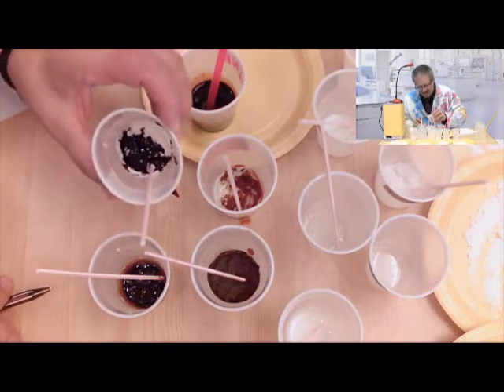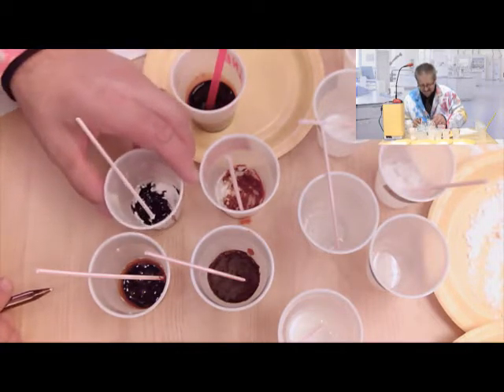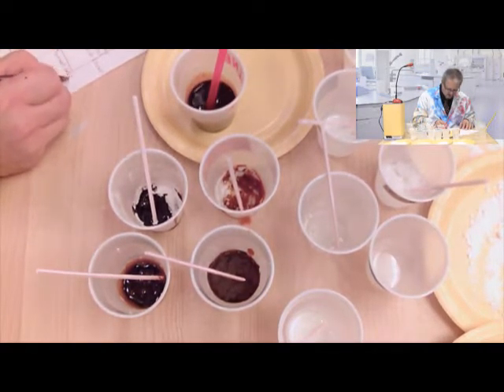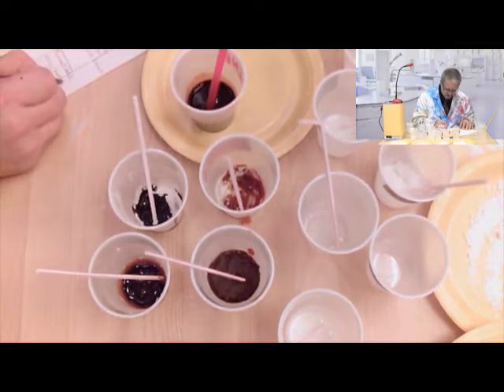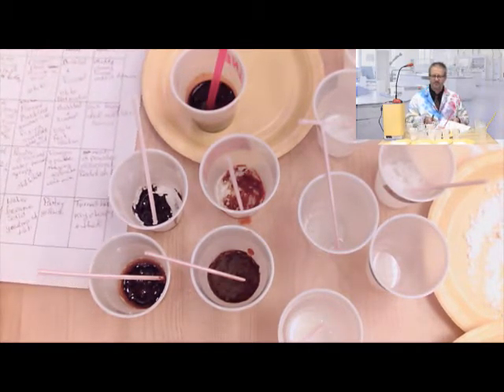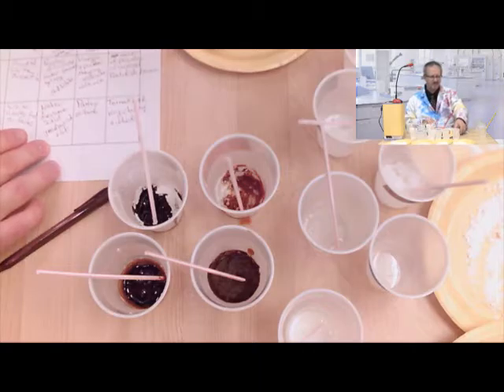And look how dark black that is. Turned really dark. So it turned black. Very clumpy and thick. Okay. So now we have all of our observations done.